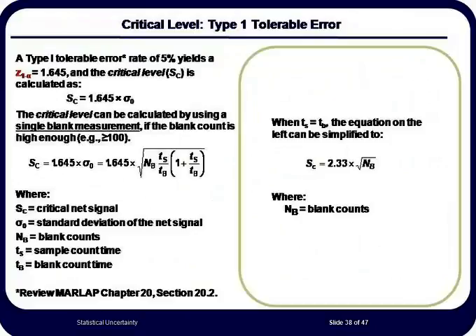under the radical sign in the second equation. When the sample and blank count times are the same, this equation simplifies to the equation shown on the right. For a detailed description of this derivation, go to MARLAP Chapter 20, Section 20.2.